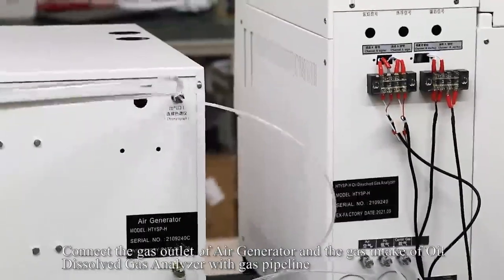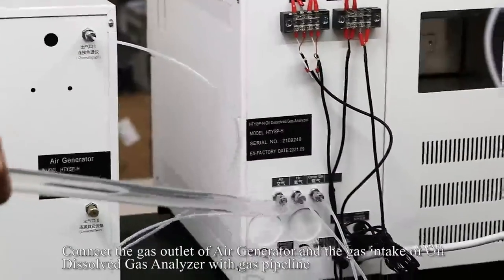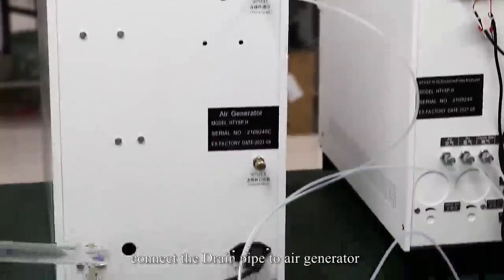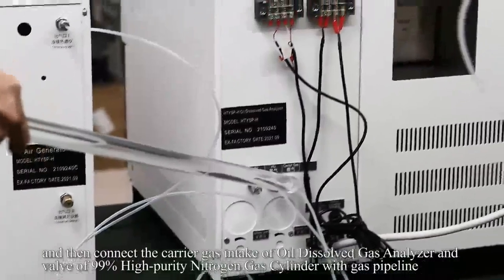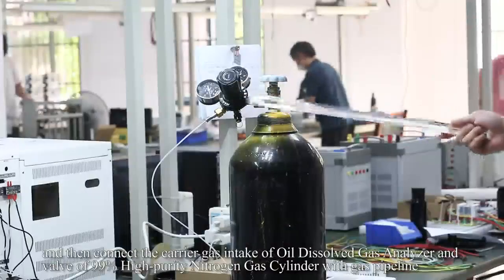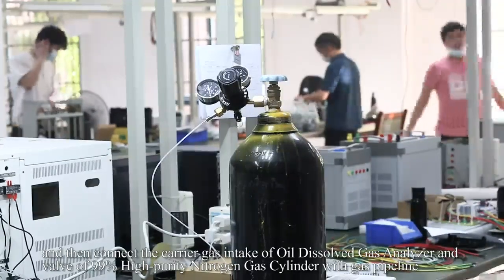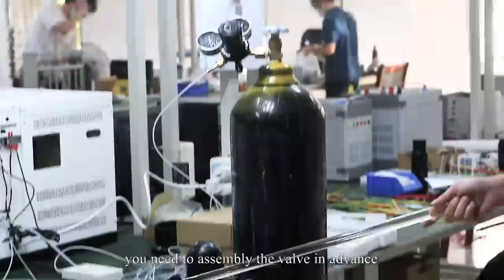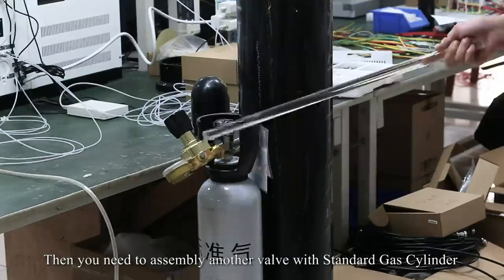Connect the gas outlet of the air generator and the gas intake of the oil-dissolved gas analyzer with a gas pipeline. Connect the drain pipe to the air generator. And then connect the carrier gas intake of the oil-dissolved gas analyzer and the valve of the 99% high-purity nitrogen gas cylinder with a gas pipeline. Before connecting our high-purity nitrogen gas cylinder, you need to assemble the valve in advance. Then you need to assemble another valve with the standard gas cylinder.